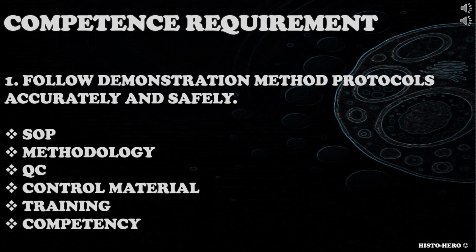How do you perform relevant demonstration methods in your lab? Do you use manual or automated method? How do you know you are following the demonstration method accurately? Consider SOPs, method used, quality control, use of control material, training, competency.